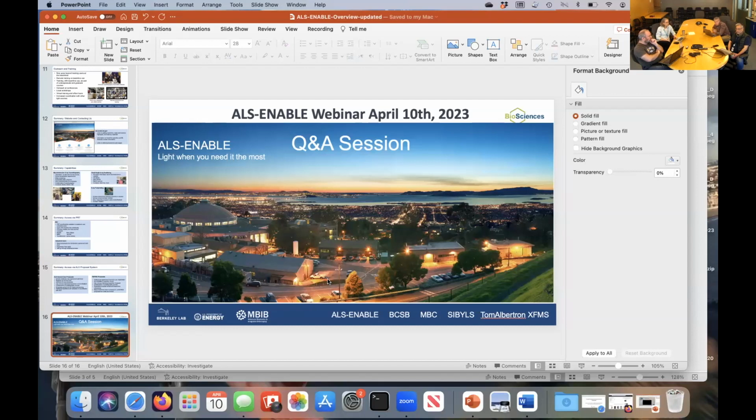Let me correct that: XDS is coming directly from XDS, but the DIALS package is coming through SBGrid. All the data can be reprocessed, but from a proprietary standpoint, be sure that you have the appropriate license to do that.